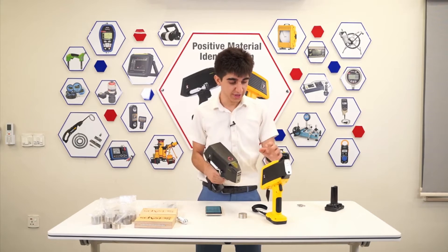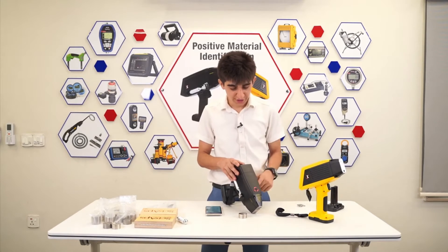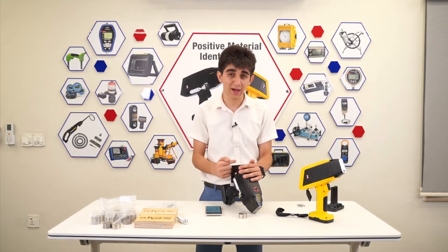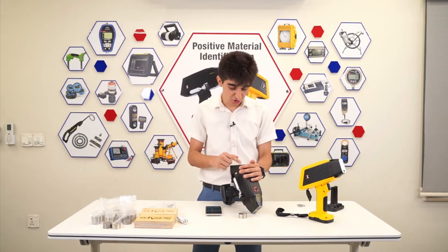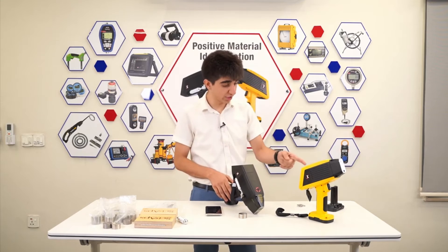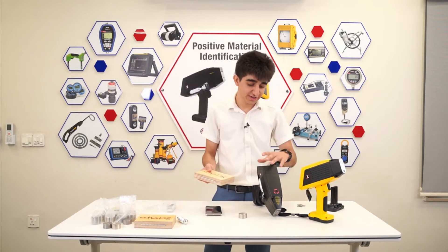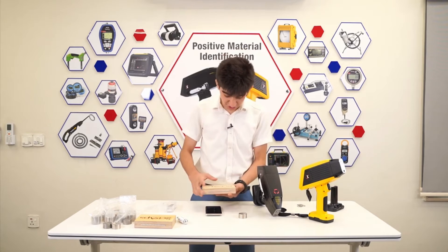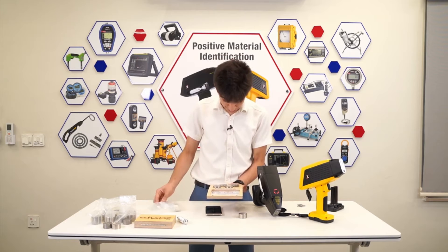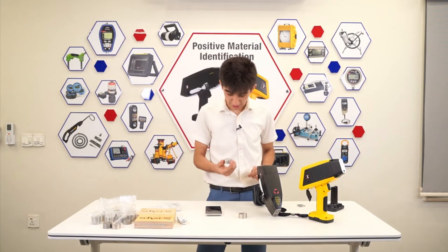Let's run a couple of tests on this also. The same basic settings go for this one. When you push the turn-on button, this screen welcomes you. You just press on Analyze and choose one of the applications, just as we did on the other unit. We press Carbon. We run the test on the block. Let's choose a different block — let's use the blocks that come with the LIBS Z902. We have many blocks that come with the Z902. Let's choose the 316 reference block.